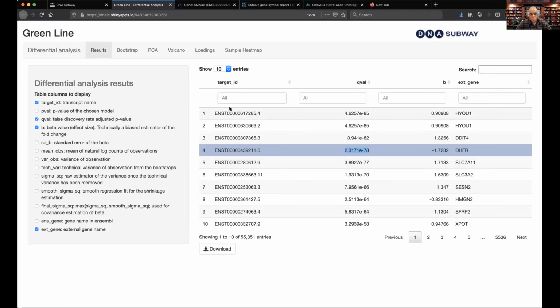So what can we do with this data? Well, there are a couple of things. I'm going to take you through a little bit of it, and we're going to explore with the last few minutes that we have left what the original paper found and see if we found the same things that the original papers have found.